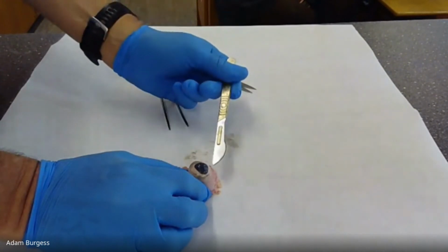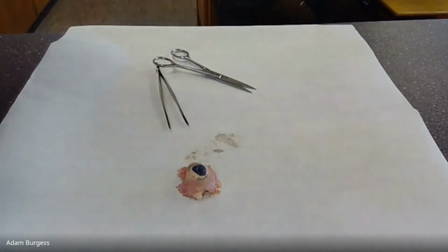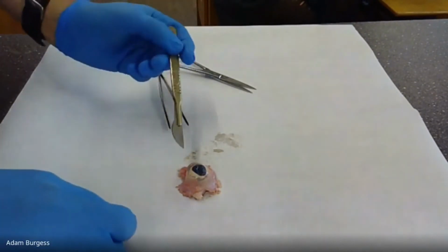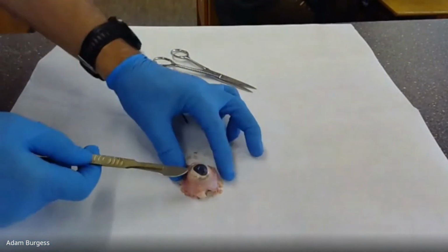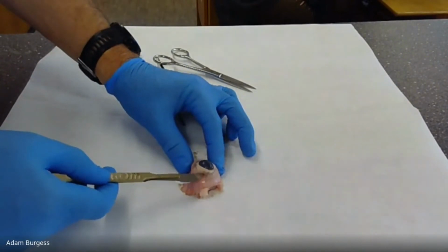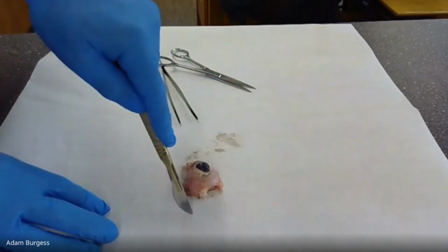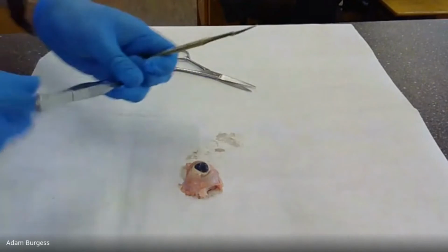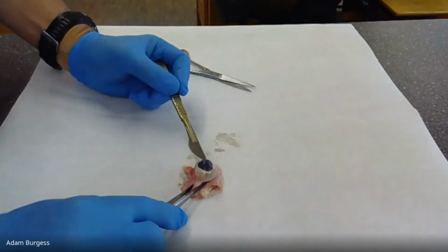That's really sharp. Now, obviously, you're going to have to be very careful when you're doing this. I don't want to see anyone doing that with things, all right? Because we're giving you A-level scalpels here, so be very careful. I probably shouldn't be cutting that way. I should be cutting away from myself. But you can see I can really poke into it, and this sharp scalpel's not breaking into it. Whereas I can cut the paper really easily, but I can't cut the sclera. So you're going to have to be very careful. You could hold it like that with the tweezers and then break open.